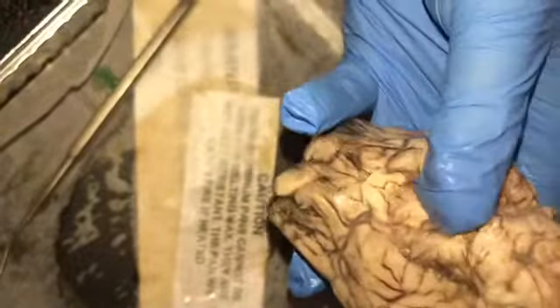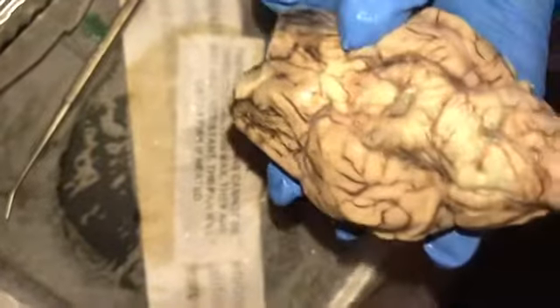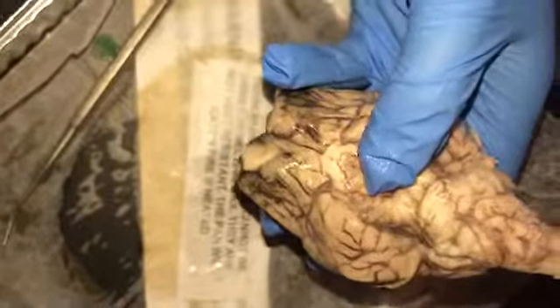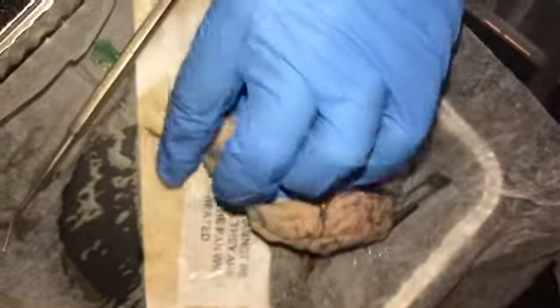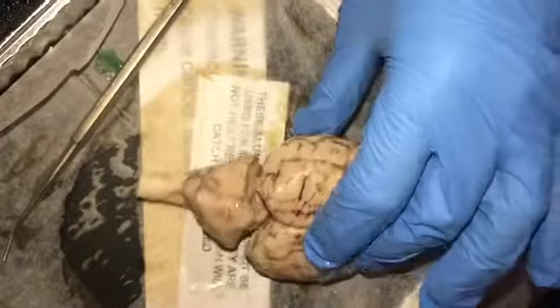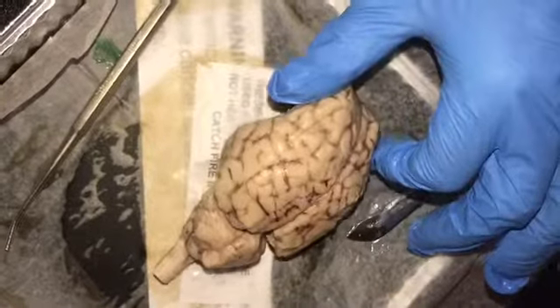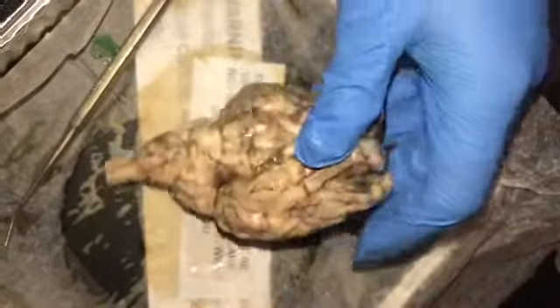The olfactory tract is a bundle of nerve fibers from the mitral and tufted cells. That would be right there. The optic nerve transfers visual information from the retina to the vision centers of the brain. Optic chiasm connects the brain to the eyes. The optic tract relays the information from the optic chiasm.